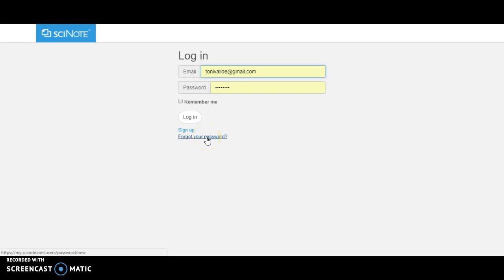Hello to everyone. This tutorial will walk you through the basics of getting started with SciNote, open source electronic lab notebook, and in my opinion, the easiest way to manage your scientific data. It will show you how to create projects, how to restore them from the archive, and how to view your activity.